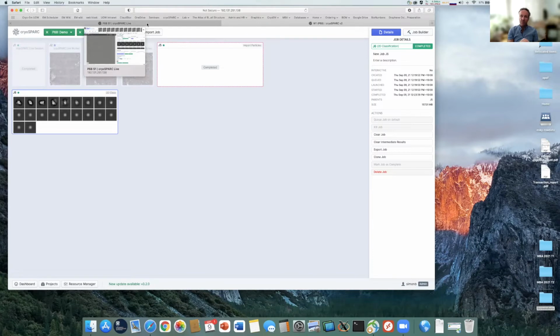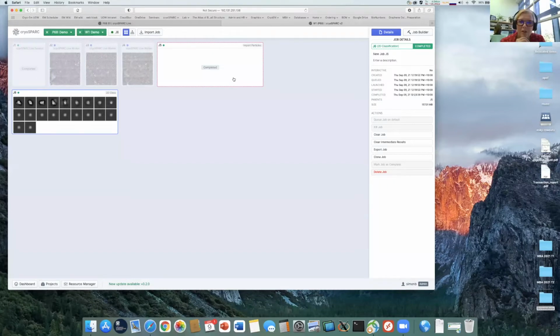But I do have workflows, which is what I'm doing today: we ran some data on Monday night on the microscope, and we did cryoSPARC Live, and it gave us quite good information. So I'm going to send that whole project down to Massive, so they can import that into Massive and continue their processing there. So can I ask you a question about how you're going to transfer that? Does it go within cryoSPARC from the website, or will you use something like Globus to transport the files, or how will you achieve that?